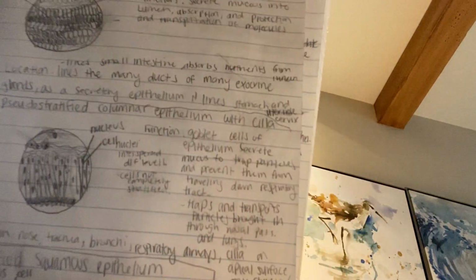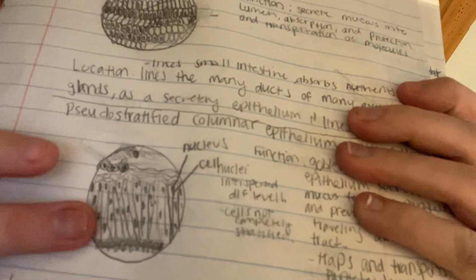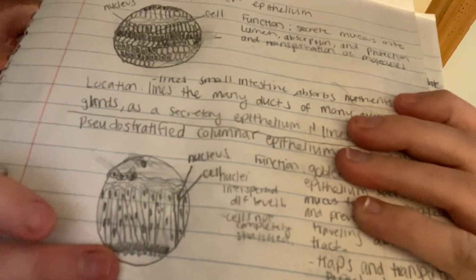The next one we're going to look at is the pseudostratified columnar epithelium with cilia. So the pseudostratified has longer cells like simple columnar, but the nuclei are interspersed at different levels. So you can see that these nuclei aren't all along the same level, they're all over the place. And you can see the cilia down here. And so the nuclei are interspersed at different levels, and the cells aren't completely stratified.